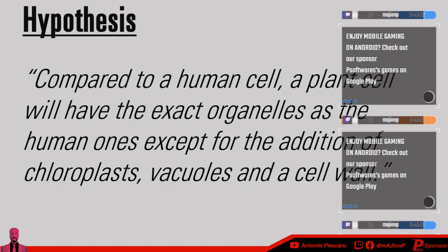Generally, all I know, and correct me if I'm wrong, definitely try to correct me in the comments, is that it's going to store liquid in that vacuole because it wants to have as much liquid as possible to be what we call turgescent, meaning that it's accumulated a lot of water inside of it.